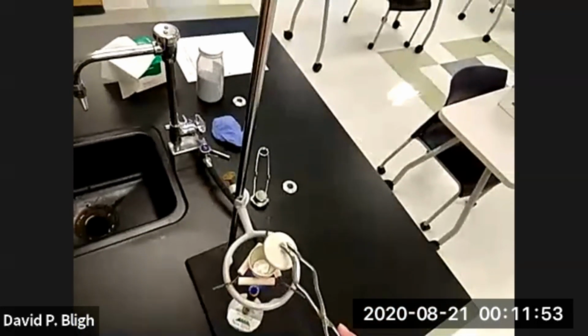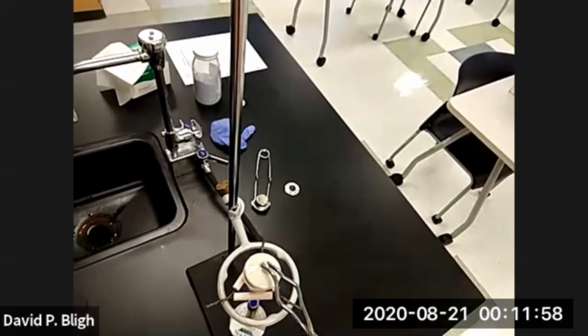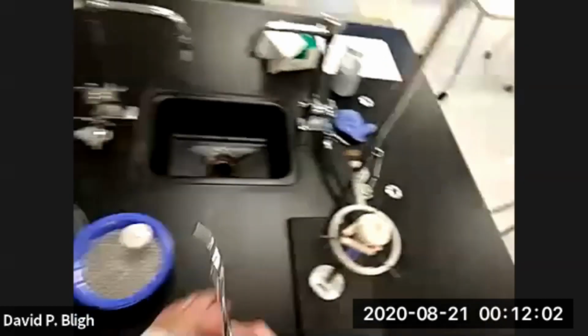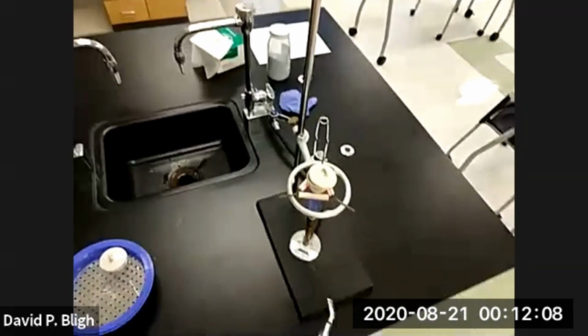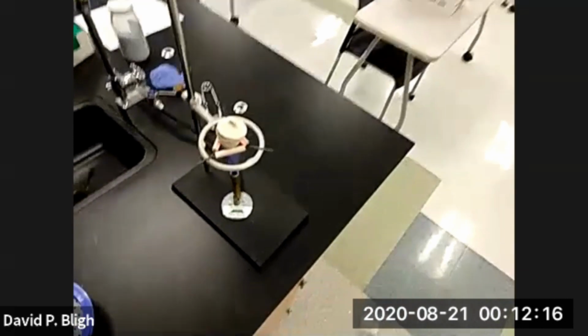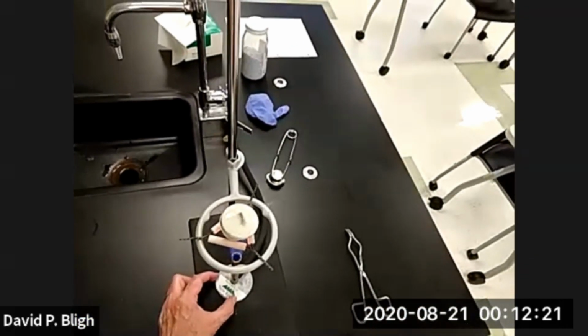I don't know if this is right or not. It may require some time, a little more time. That could introduce a lot of error because this weight was higher than we should have. It was more than 2.7. It was actually 2.8. So if we go a little longer, that's a good thing. Let's give it a few more minutes.